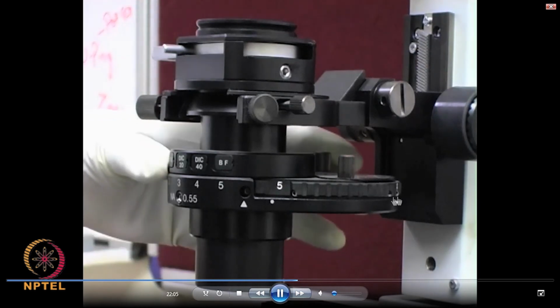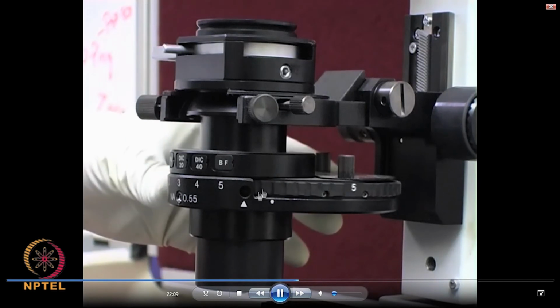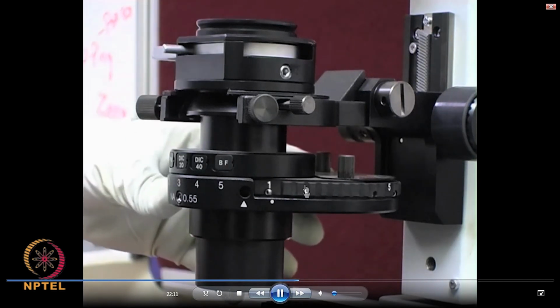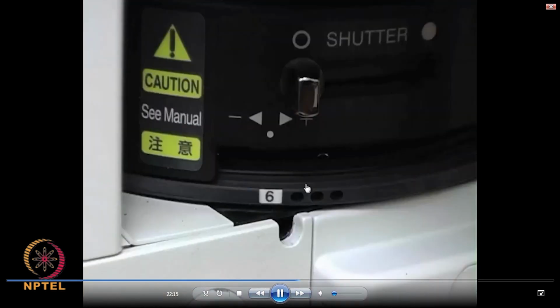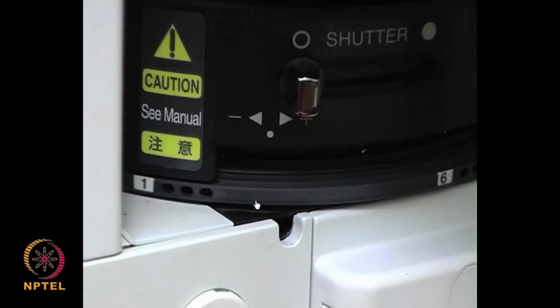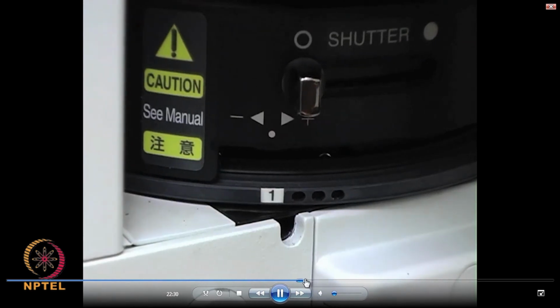When you rotate this condenser apertures and filters, this particular aperture will have the phase plate inside. Similarly, here also you will have the phase plate. Whatever we have seen as a phase plate will be kept inside this along with this condenser apertures and filters.